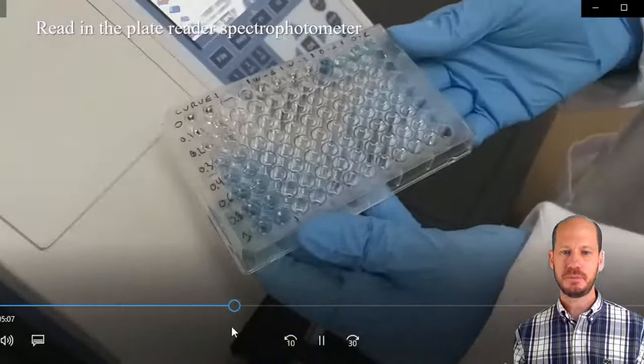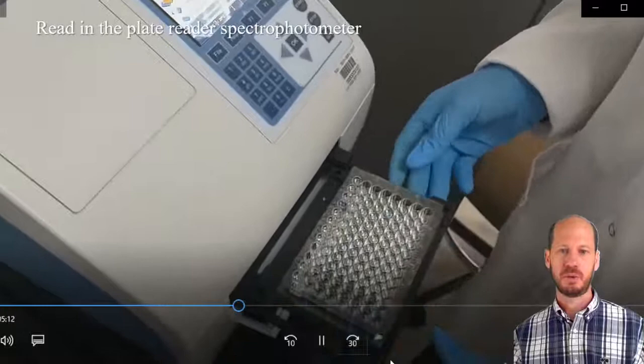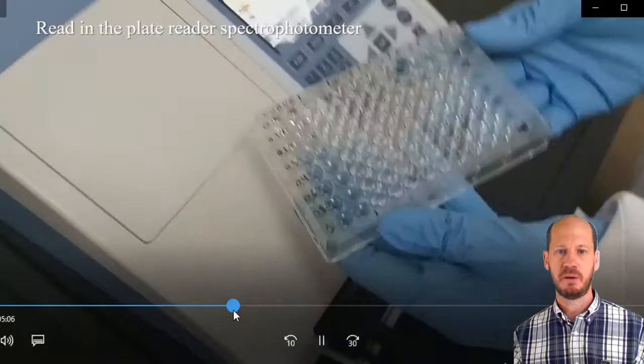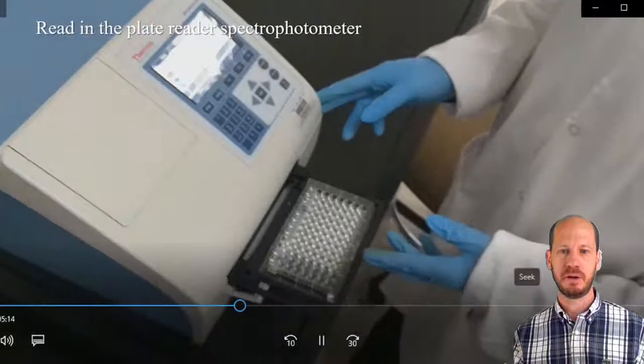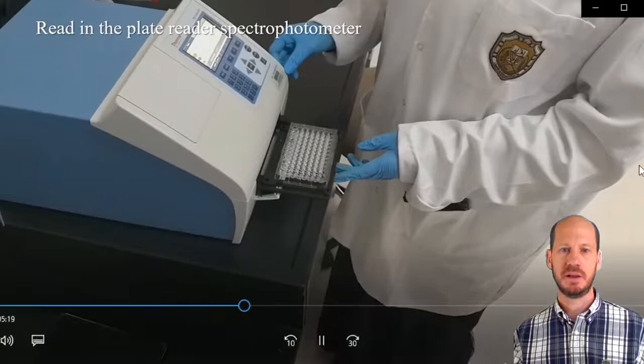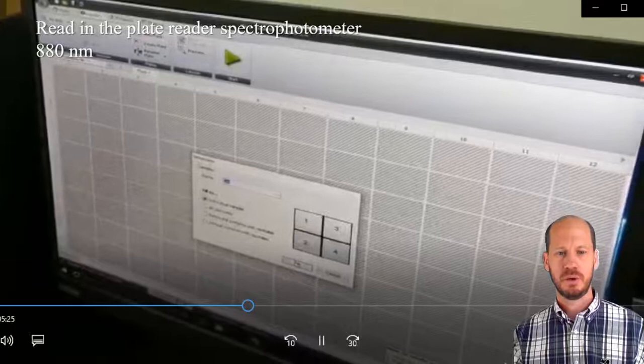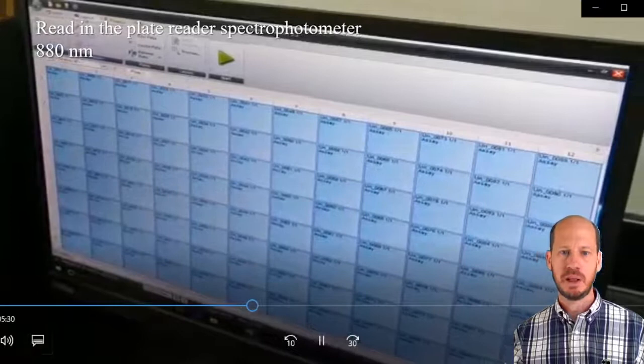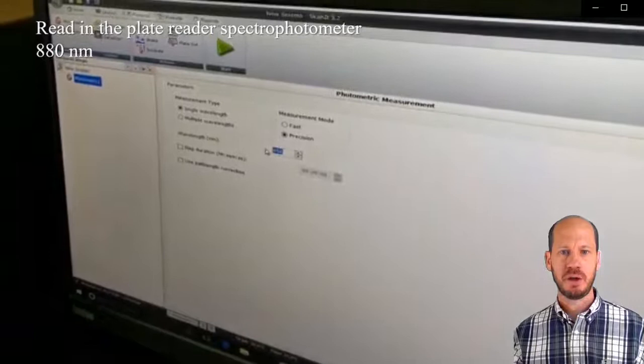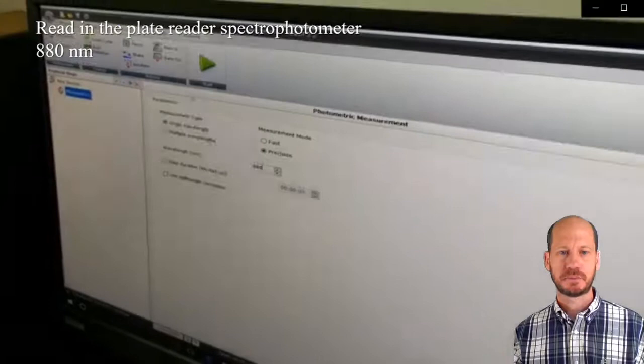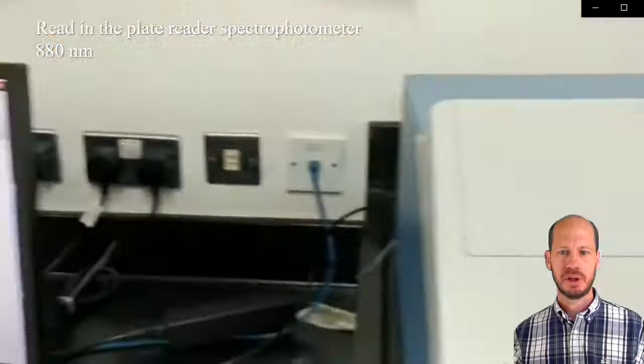Now she is placing the microplate on the plate reader. If you look back, you will see the color difference on the plate already developed. Every standard will have a different color. We're going to configure the measurement and ask the equipment to read it. To configure on the software, we ask it to read the full plate, mark everything as unknown. Set up the method as photometric precision, and set the wavelength to 880 nanometers. Then press play.